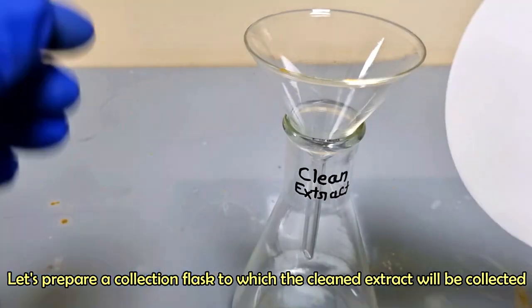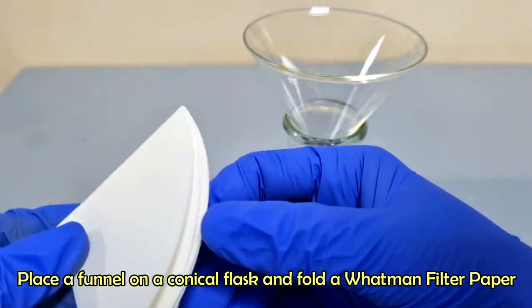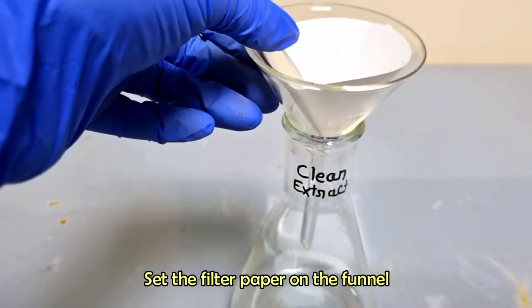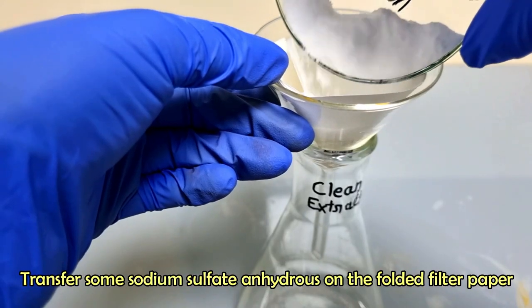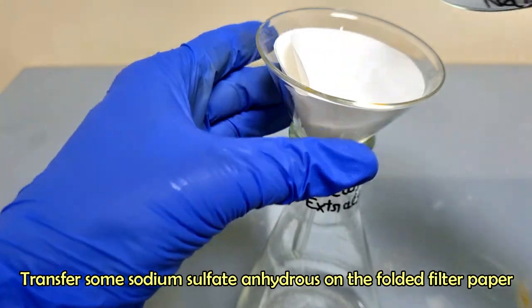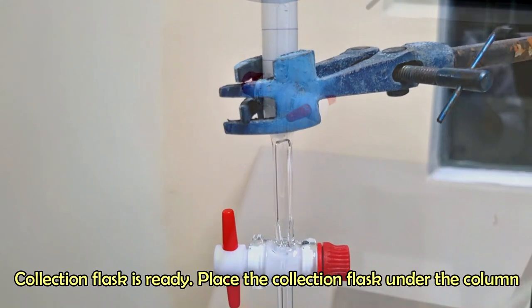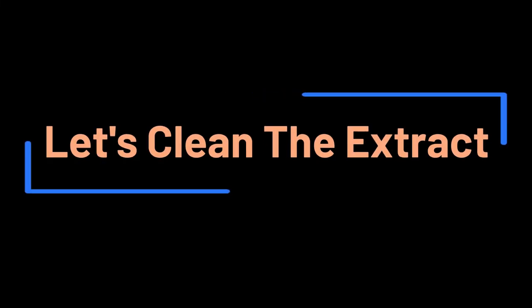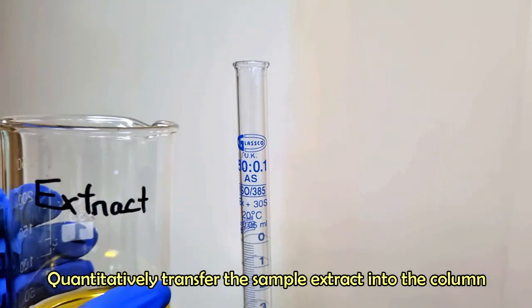Prepare a collection flask using a funnel and Whatman filter paper. Bring the dried anhydrous sodium sulfate and keep an amount of it on the filter paper. Place the collection flask under the column. Now, we will clean the sample extract using the newly prepared column.